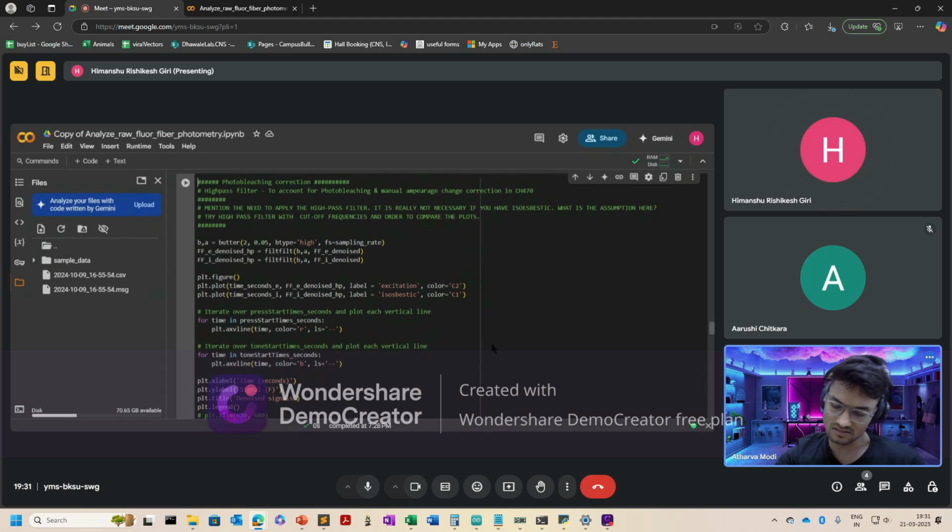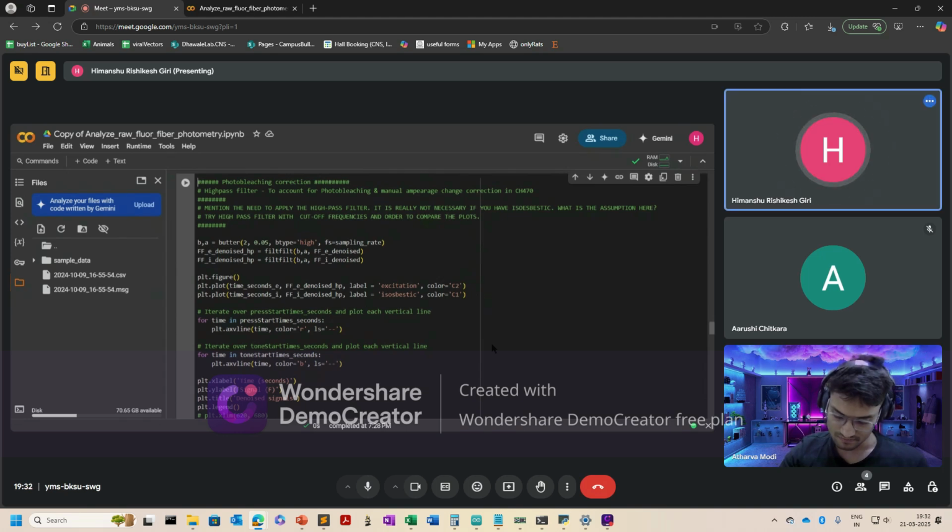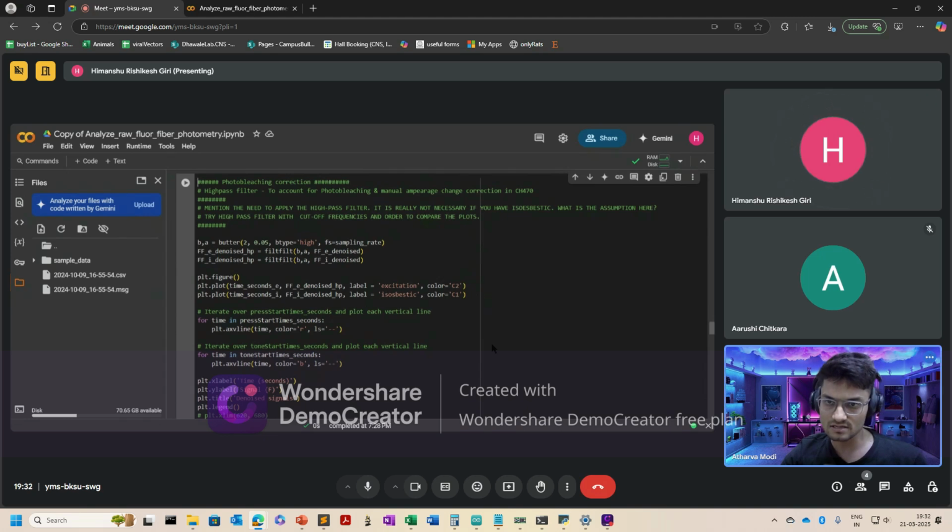It is not only analysis, but different hardware also. It not only records intensity, but also the time delay between light excitation and emission. That kind of hardware is also required. But it is an upcoming advance in the field. Yes. Okay.